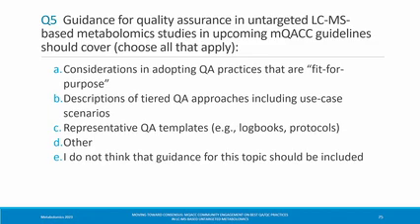But first thing is to establish what will be that criteria. And for untargeted LC-MS, this is the first challenge here, of course. And for sure, I think there should always be a kind of agreement of organization between different labs for establishing this.